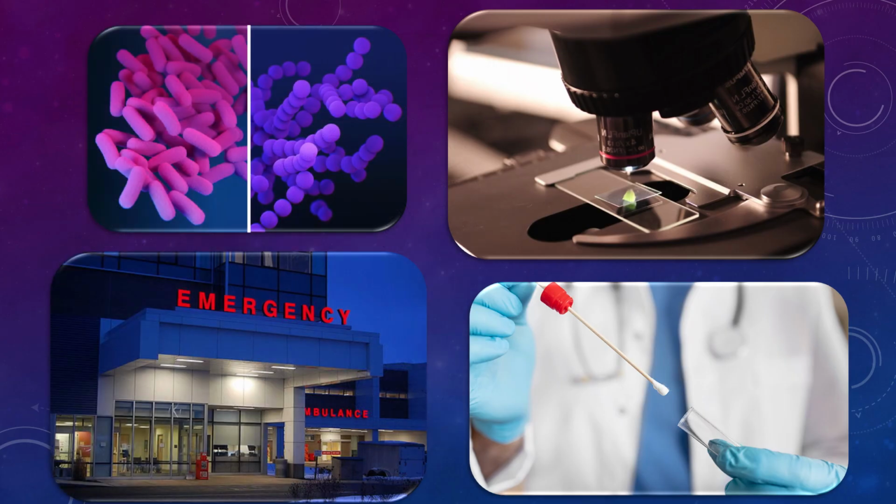It's important to note that gram stains are still widely used in hospitals as a fast, essential, and low-cost diagnostic tool to identify bacterial infections, guide initial antibiotic selection, and determine if bacteria are gram-positive or gram-negative.